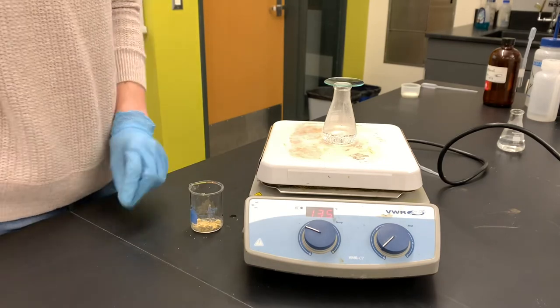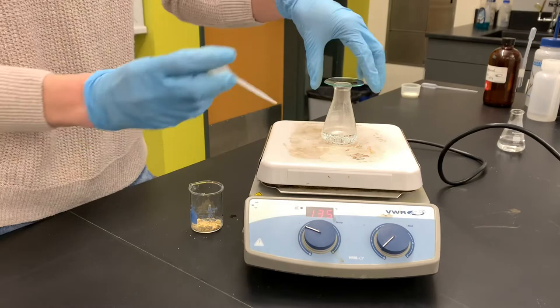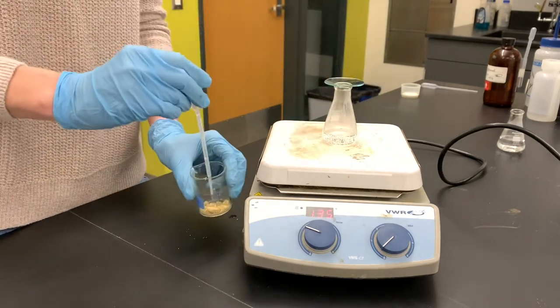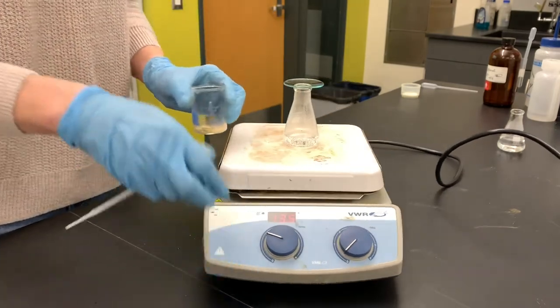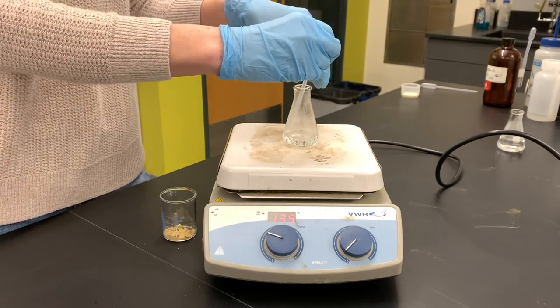And then what I'm going to do is take a little bit of this. This is the 50% ethanol. It's not boiling yet, but it's getting pretty close. I'm going to put a little bit of it in here just to get it a little bit damp so that I'm not putting our dry product straight on the hot plate.